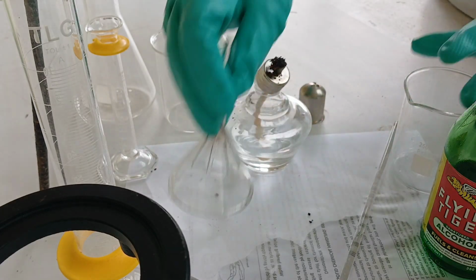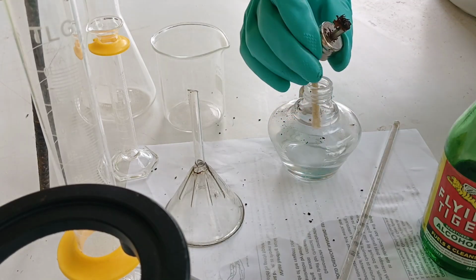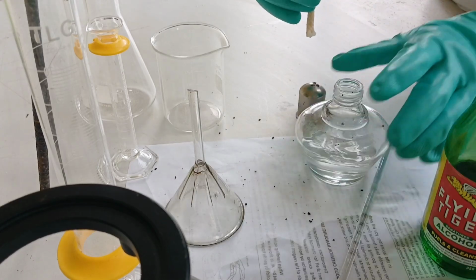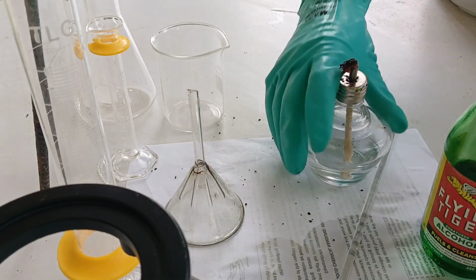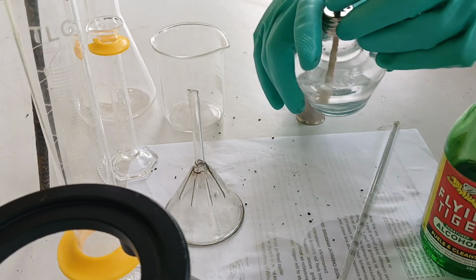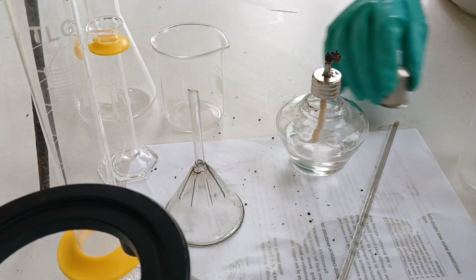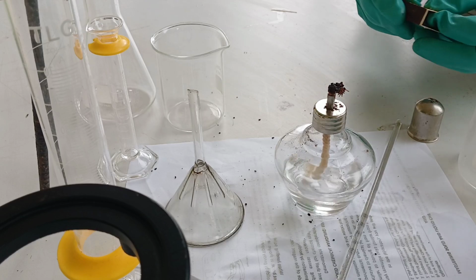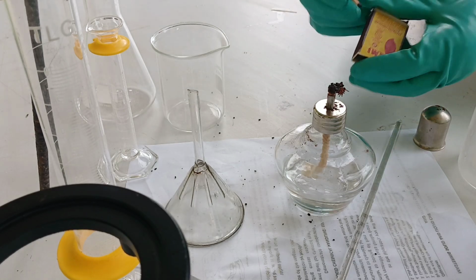And of course, since your alcohol lamp has not been used for how many years, I attempted to wet the tip of the cloth so that it would easily catch fire. It's very, very dry. That's why I'm getting some from the other container. After that, I should get a matchstick, and try to light the alcohol lamp to cause a flame.